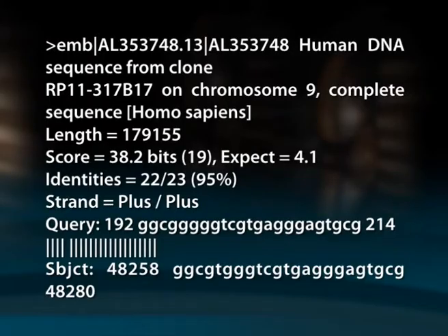The 5 lines comprise a while loop which keeps matching the pattern as many times as it appears in the string. Each time the program cycles through the loop, the pattern match finds the value, or the entire alignment, then determines the key. The key and values are saved in the hash alignment hash. Here is an example of one of the matches found by this while loop when passing the BLAST output shown earlier. This text starts with a line beginning with a greater than character. In the complete BLAST output, sections like these follow one another.